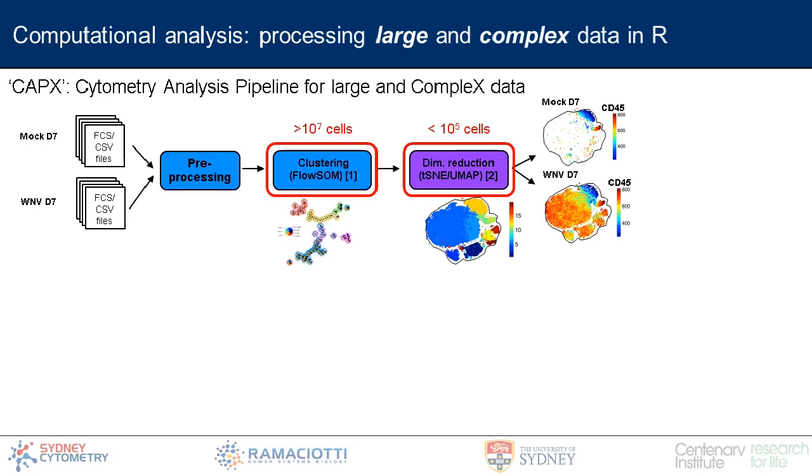However, things like t-SNE or UMAP have some significant limitations. These don't necessarily scale all that well. And this isn't just a computational time problem. Obviously, the larger the data set, the longer the calculations take to be able to effectively run these tools. However, this isn't the only limitation. There is actually a sort of a non-scalability here. The more cells we try to run in any given t-SNE or UMAP plot, the more crowded, the more sort of convoluted the plot gets. And so we end up with a functional limit of how many cells we're able to incorporate in this kind of plot.